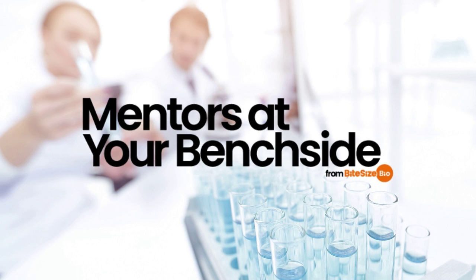Generally, you measure the absorbance of a series of known concentrations of standard proteins, e.g. bovine serum albumin, BSA, or bovine gamma globulin, BGG, to create a standard curve. Unlike the Folin and Lowry method, the Bradford assay doesn't have a set endpoint, so you have to use this standard curve to back calculate protein concentration. Bradford protein quantification is quick, easy, stable for up to an hour, and isn't affected by the presence of reducing agents in your buffer.